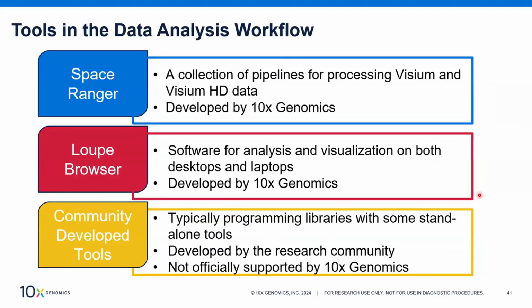To analyze all this data, we have different tools that are included in the workflow. Some of you may already be familiar with Space Ranger. Space Ranger is basically a collection of pipelines for processing the Visium data. This is developed by us. You can download it without issue, as long as you have a very big RAM available to you.